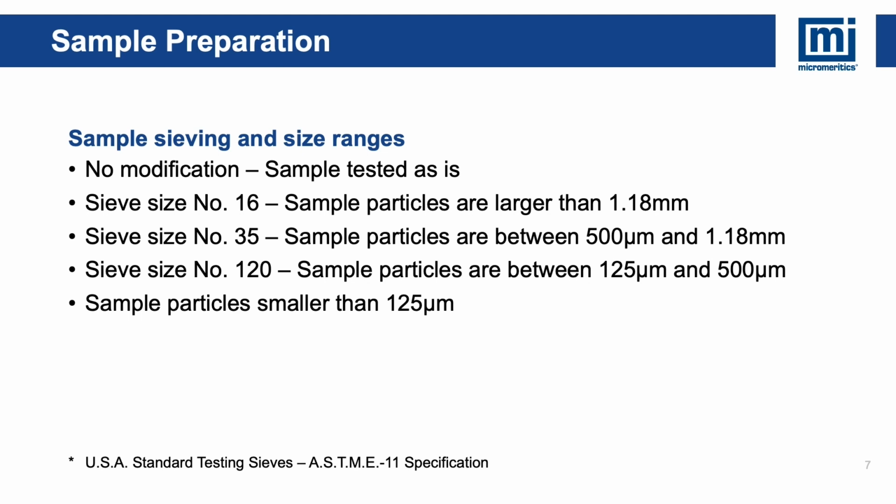This means the particles from one size range are not the same exact particles ground finer in another size range. All materials came from the same lots. It is common to see larger particles in lower size ranges due to particle shape not being uniform. For example, an elongated particle can fit through the mesh depending on its orientation.